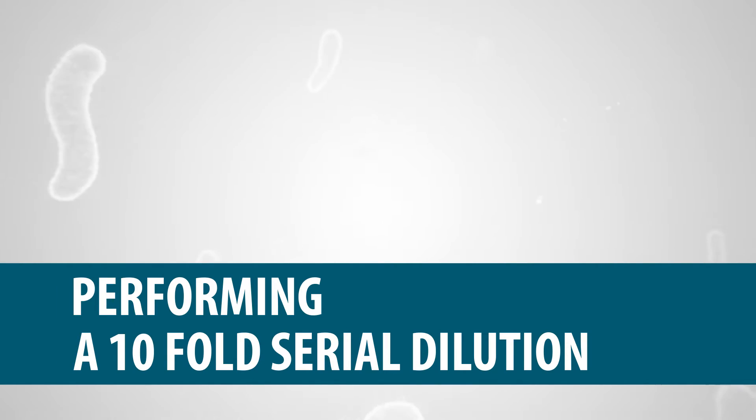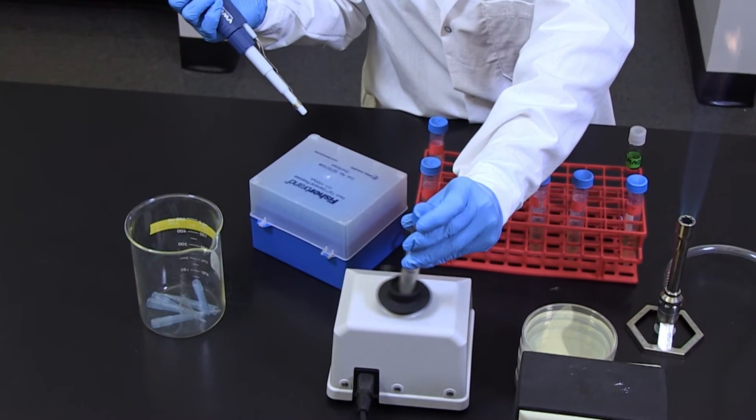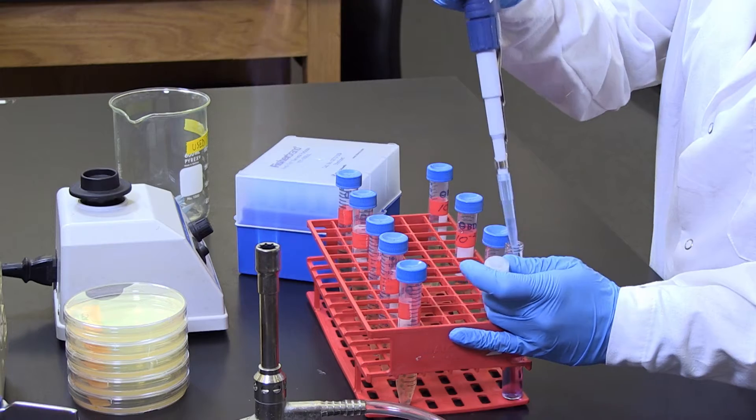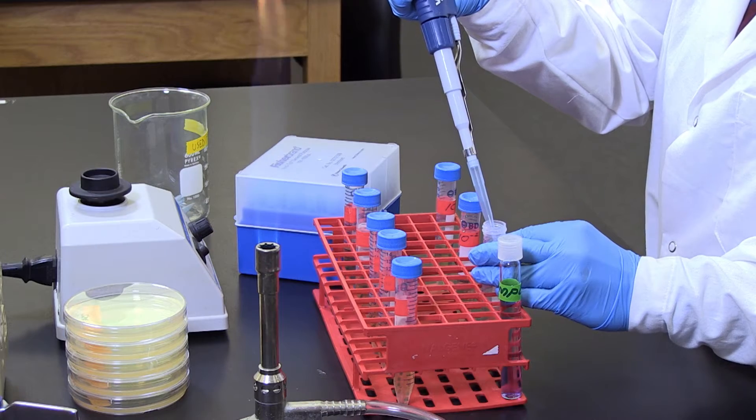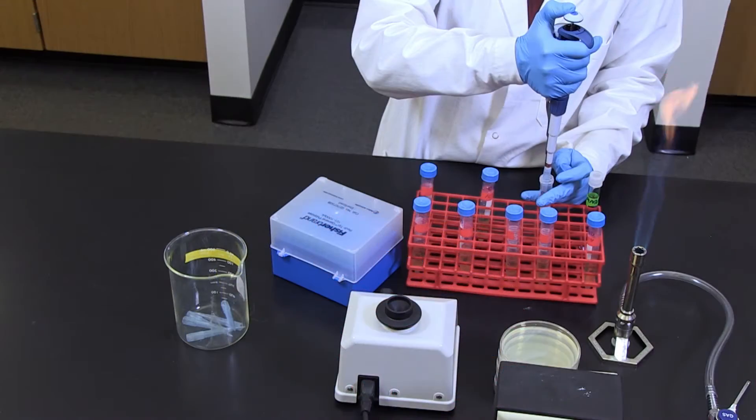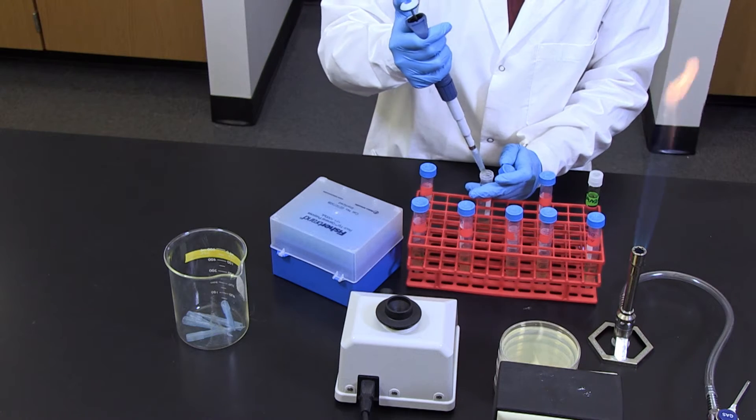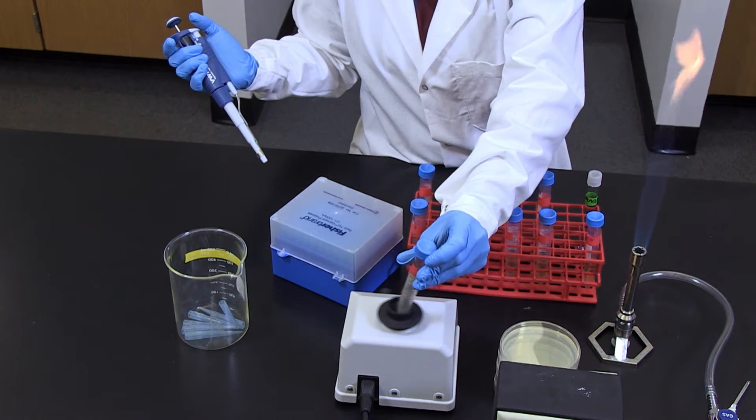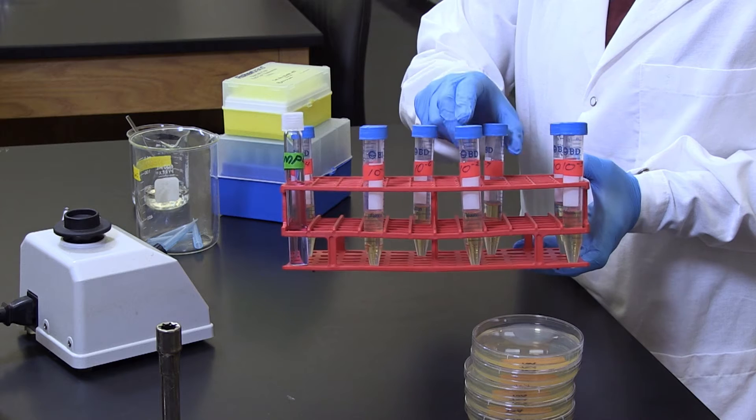Performing a ten-fold serial dilution. Before you start, use a vortex mixer to ensure the sample of bacterial culture is mixed well. Apply aseptic technique with a micropipette to transfer 0.5 milliliter or 500 microliters of the culture to the test tube labeled ten negative one. Mix the test tube well. Then, transfer 0.5 milliliter of this solution into the test tube labeled ten negative two. Mix this test tube well. This process is repeated until all eight test tubes are done. Now, you have a ten-fold serial dilution of your bacterial sample.